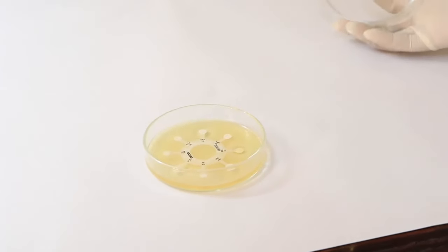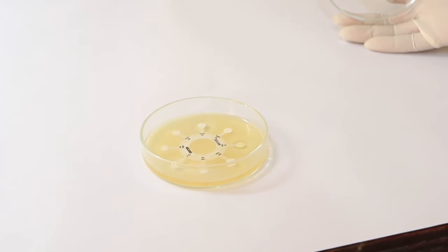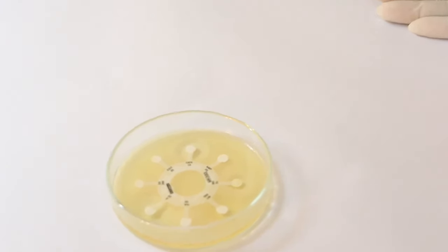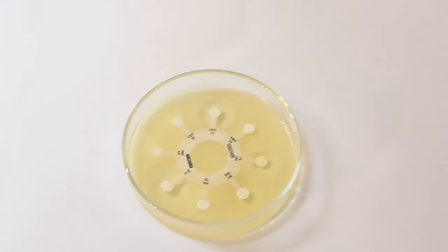After the bacteria have grown, you can see a clearing around antibiotic discs called the zones of inhibition. The bacteria are only susceptible to some kinds of antibiotics.